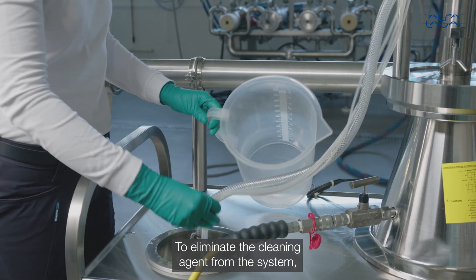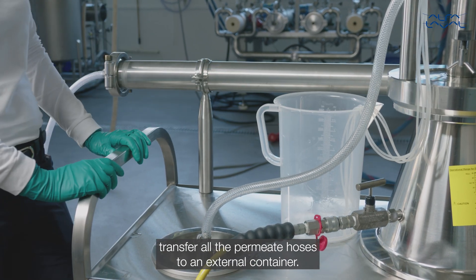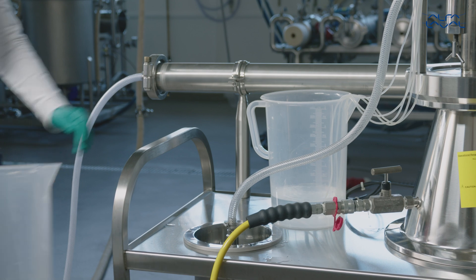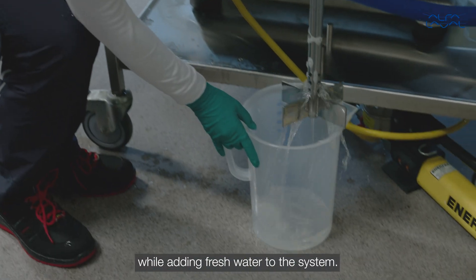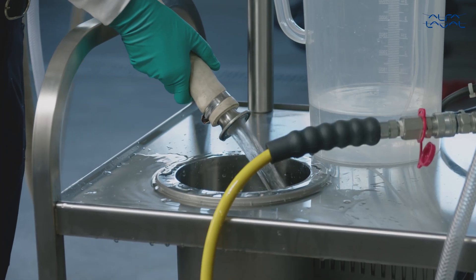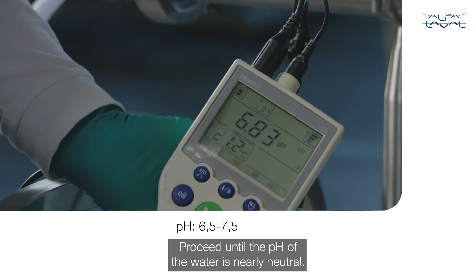To eliminate the cleaning agent from the system, transfer all the permeate hoses to an external container. You should also collect the retentate in an external container while adding fresh water to the system. Proceed until the pH of the water is nearly neutral.